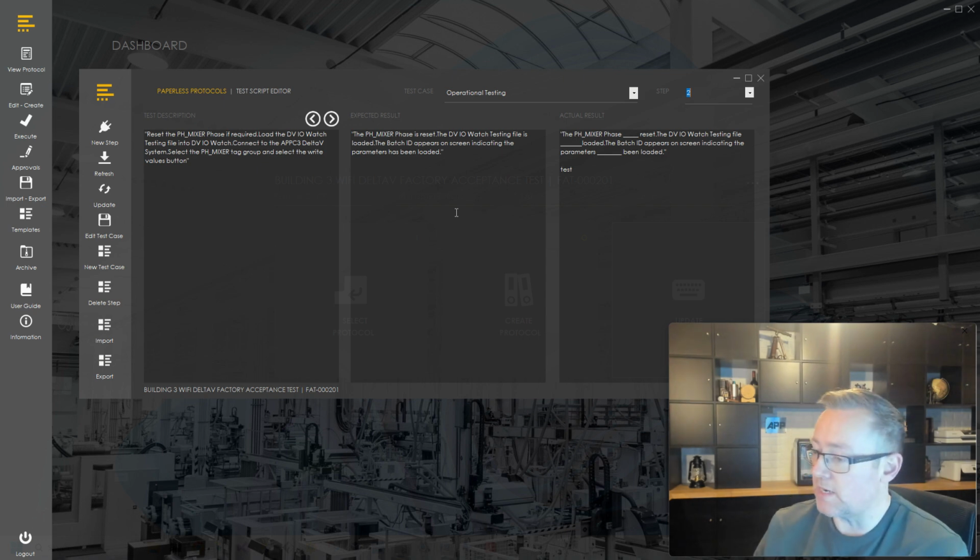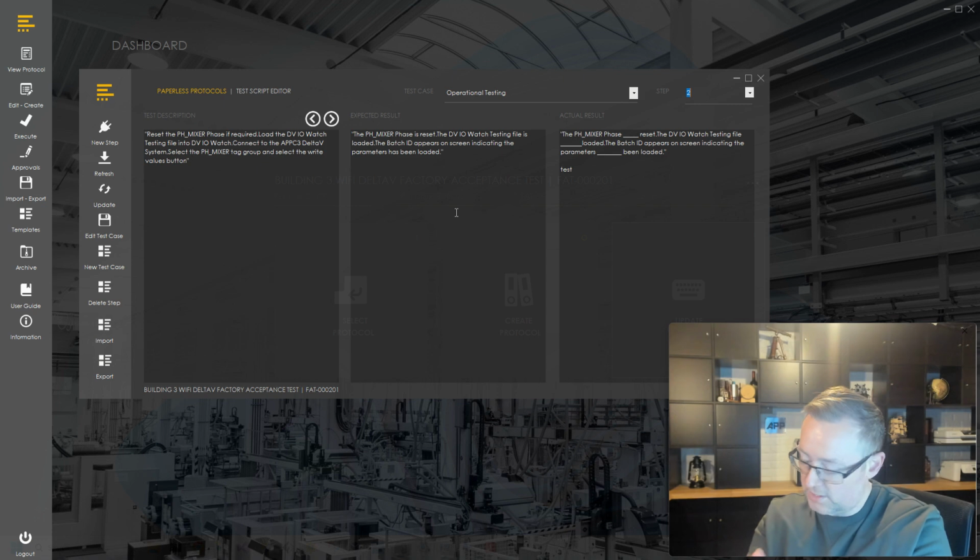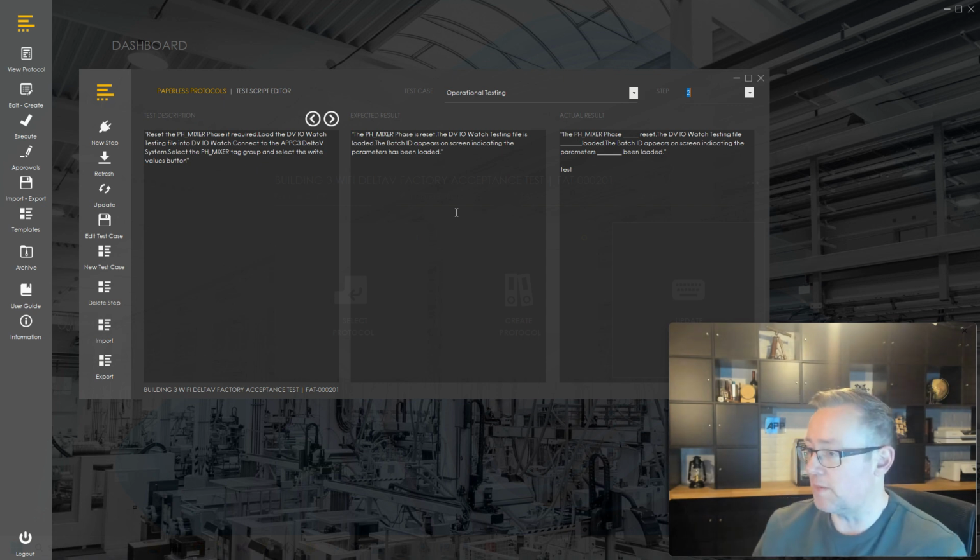That's the most realistic way to have something like this fit into a digital strategy: you're not trying to eat up an entire quality system and replace it, you're just looking at the little slot that you fit into, and then you go with it.